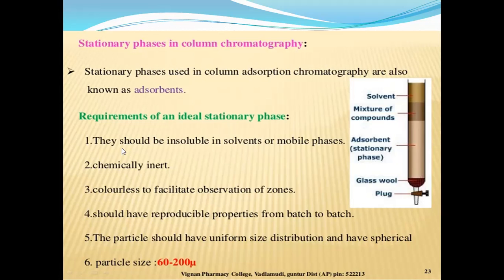The same phenomenon we should apply here. So the stationary phase and mobile phase should be insoluble in each other. If we select a polar stationary phase, then we should go with a non-polar mobile phase, and vice versa.